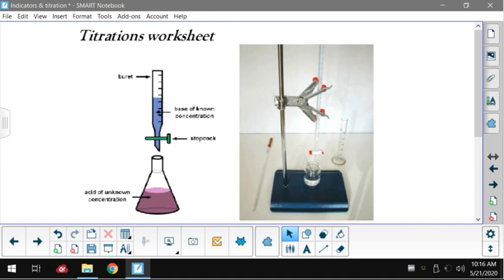Each one of the indicators is going to be either a milliliter or a tenth of a milliliter, and so you can go beyond that to get really accurate. So that's a burette. You also use this thing here down at the bottom. It's called an Erlenmeyer flask. An Erlenmeyer flask is used because you can swirl it. You can swirl it by hand, or you can put a stirring bar in it. It'll stir, and the stuff won't splash out.